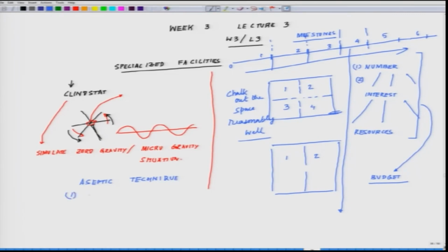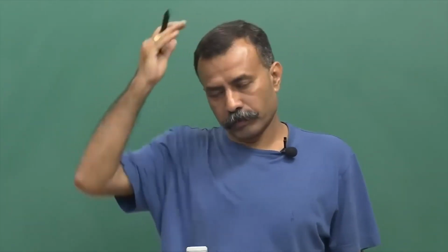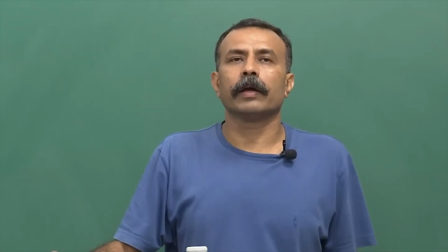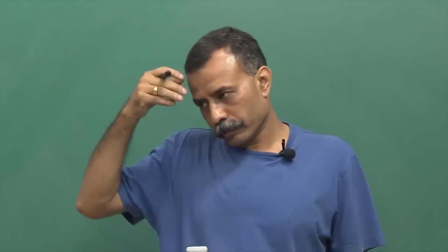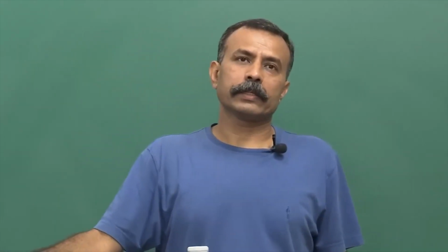Second, personal hygiene, personal health. Next, make it a mandatory point to have hair caps, so that if there is hair fall or something, it is not going to contaminate the system.